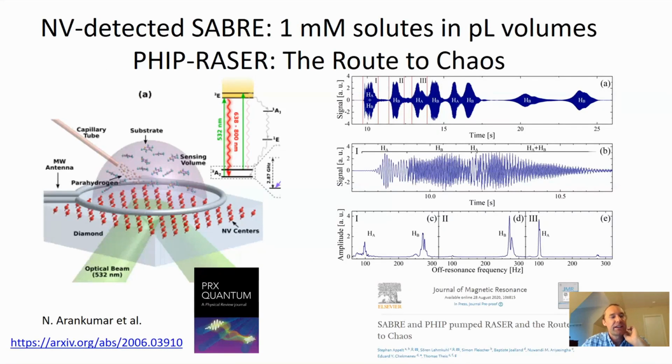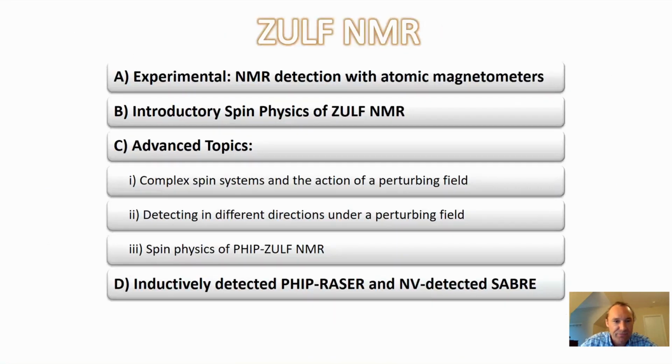So the first... Thomas, can I quickly just interrupt you, because there is a question, and I'm sure you will cover that, but still it's good to. Yes. So what contributes to easier shimming at low fields? Is it the smaller size of the measuring volume or less susceptibility difference or other factors?